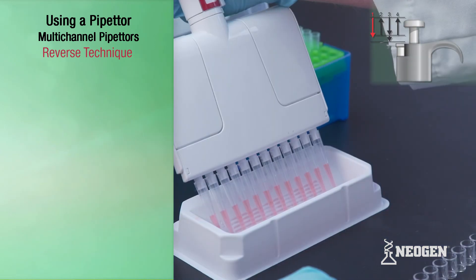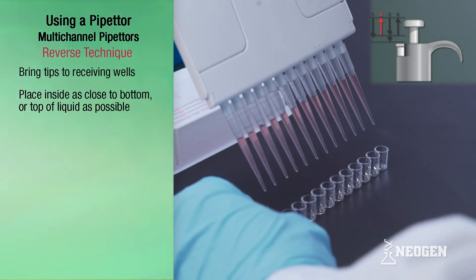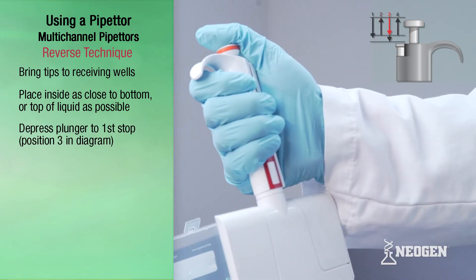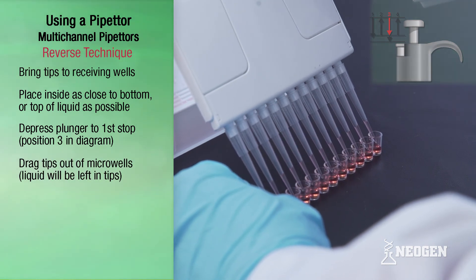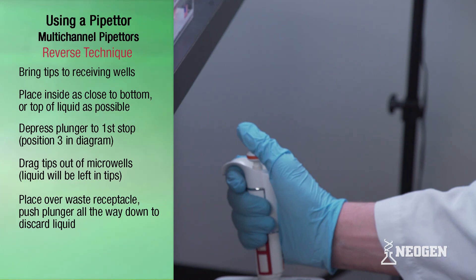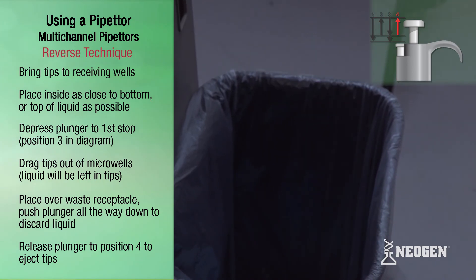Bring the pipetter with filled tips to the wells and place the tips against the inside walls of the wells as close to the bottom or as close to the top of any existing liquid as possible. Slowly depress the plunger to the first stop of position three and drag the tips out of the microwells — there will be liquid remaining in the tips. Next, position the pipetter with tips over a waste receptacle and push the plunger knob all the way down to discard the remaining liquid. Release the knob to position four and eject the tips.